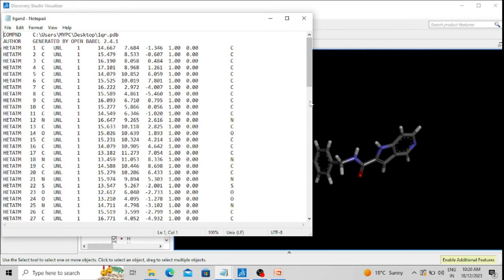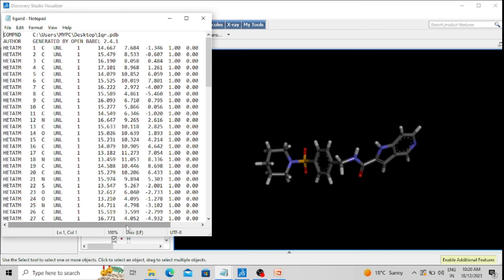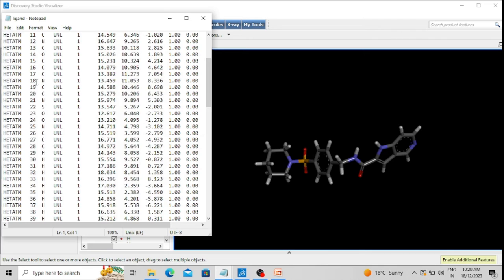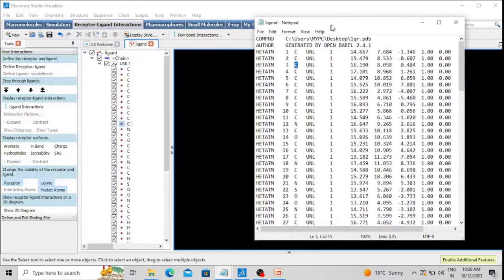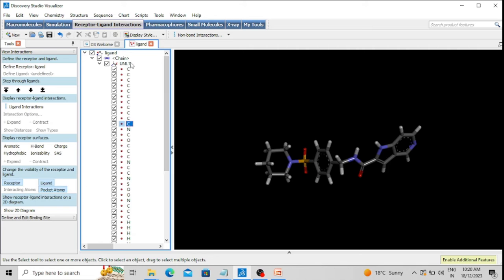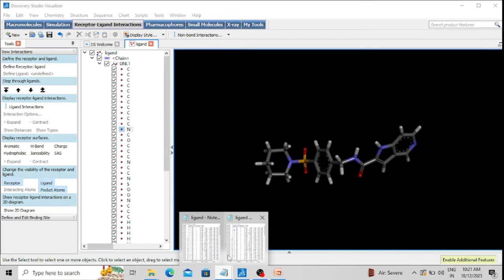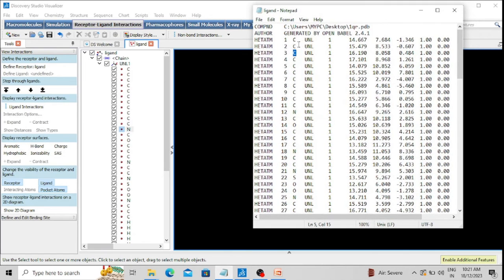The information in the PDB file format can be visualized in visualization software. Here you can see a number of different atoms — carbon 1, carbon 2, carbon 3 — and you can also view this in the viewing panel of BIOVIA Discovery Studio. The same information is there: numbering of carbon 1, carbon 2, carbon 3, carbon 4, carbon 5, carbon 11, and at position 12 nitrogen is present. You can also see the 3D coordinates — the x, y, and z values — of each atom, such as carbon number 1.